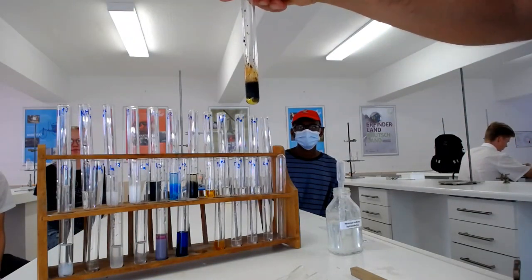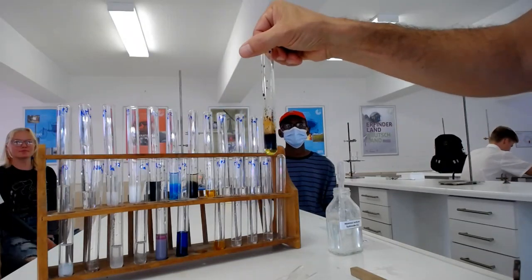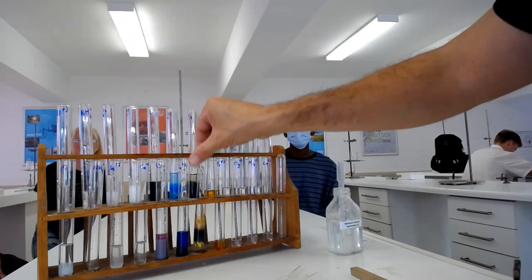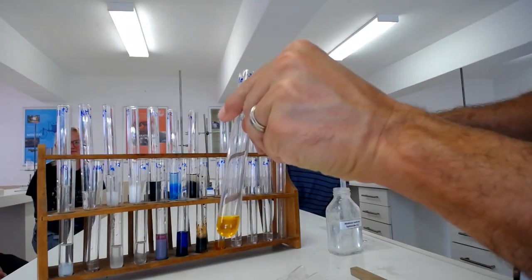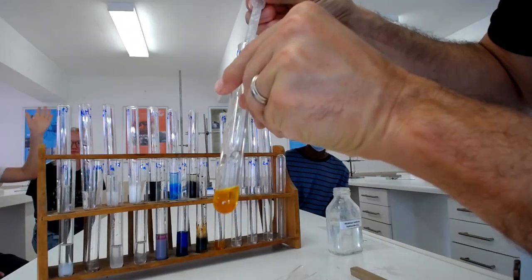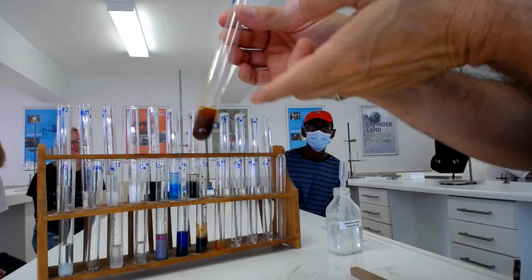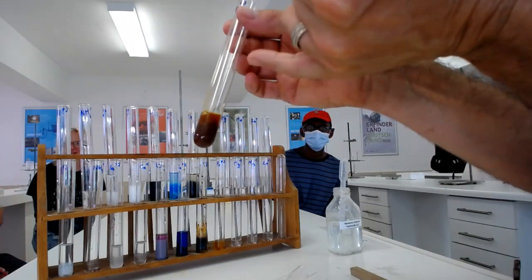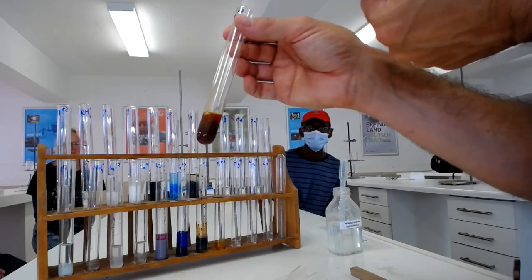So what happens to iron 2? Because iron 2 is the most common one that we have, it rusts. So what about iron 3? It's red-brown, the same shade. So it's already red-brown, so it's not going to oxidize further. So this is how we distinguish between iron 2 and iron 3. Your iron 2 is going to oxidize.